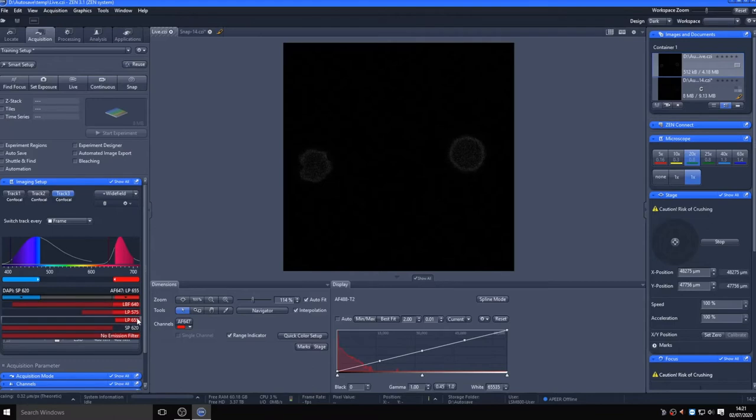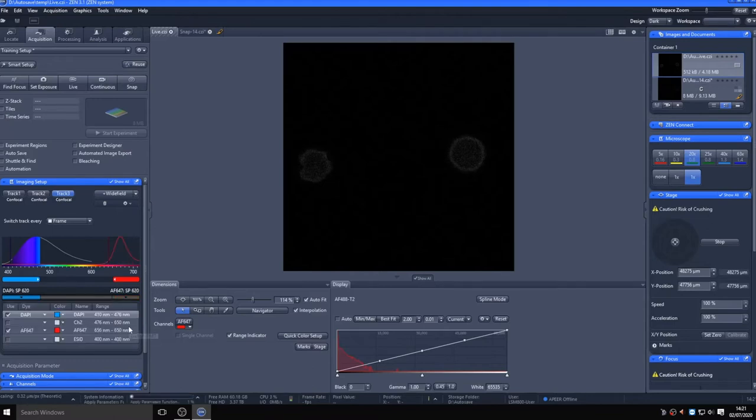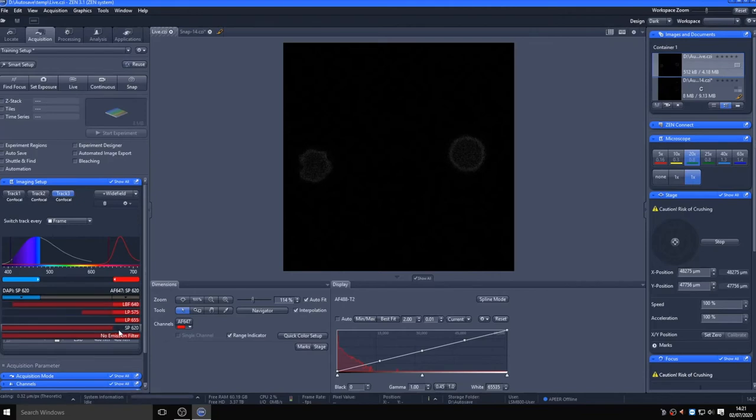This is easiest by going back to smart setup and selecting the best signal option rather than smartest. Note though that if you apply changes in smart setup, you will need to reset the acquisition settings.